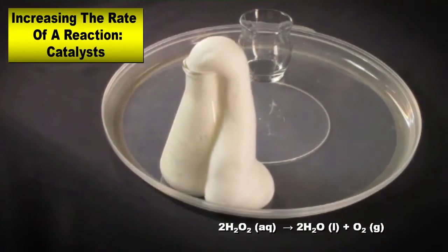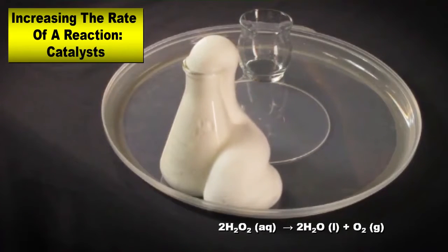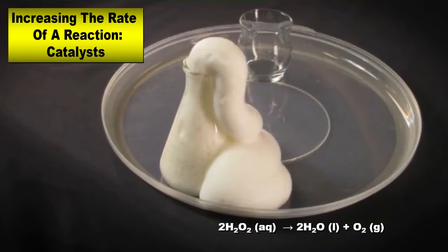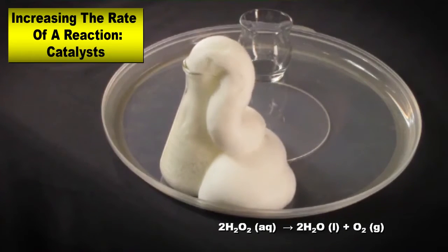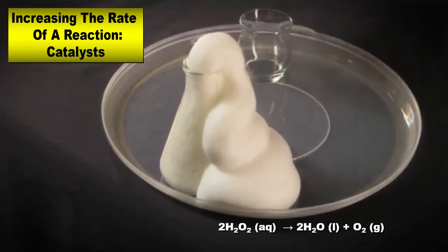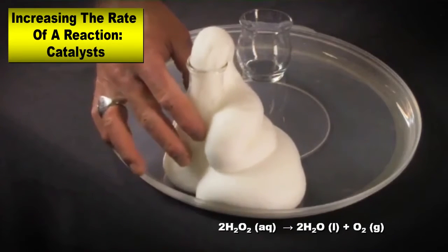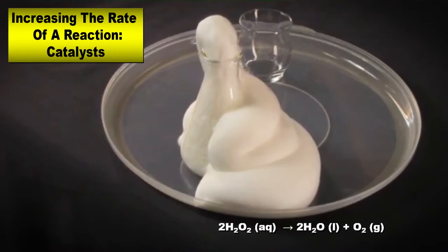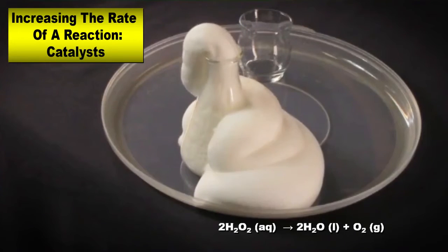Also look at the size of the bubbles. Now the bubbles aren't really big. In fact, it looks like little tiny foam bubbles associated with it. But certainly, in the very process of this happening, you can say we are producing quite a bit of stuff here. We'll move this just a little bit over. Isn't that kind of fun? Look at that. Just going around and around and around.